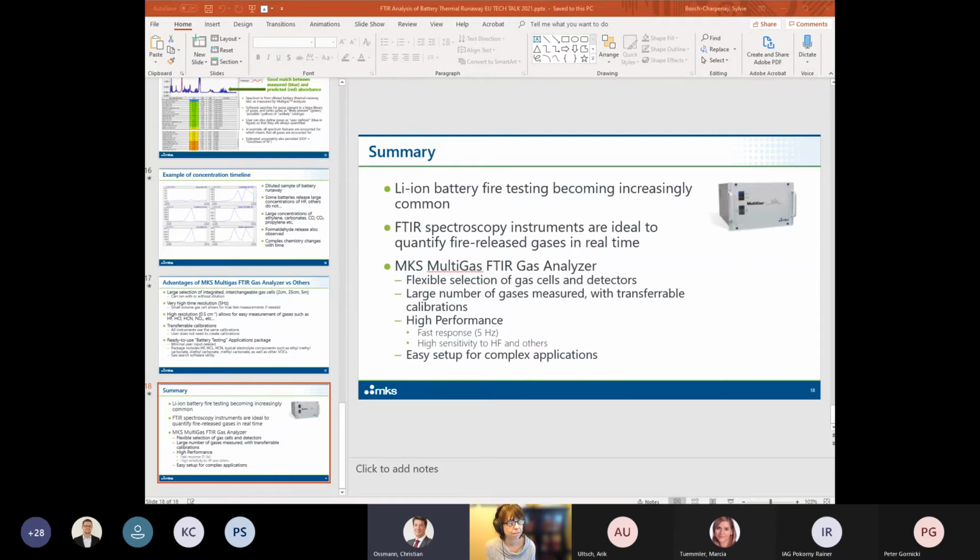And the second topic which popped into my head during your presentation is that an infrared spectrometer is somehow sensitive to gas, and fire by its nature is not a cold gas. Is some kind of cooling down of the gas necessary, or can the probe be taken directly from a source and inserted into the gas cell? That's a good point. This is all sampling, obviously, issues. It all depends on how much distance you might have between where you do the sampling and where the analyzer is.